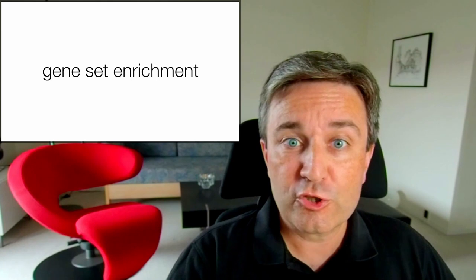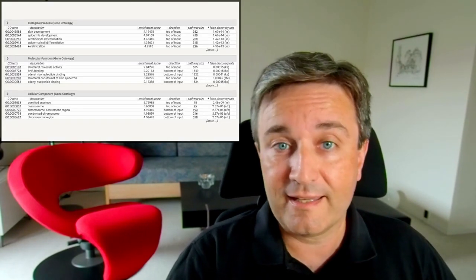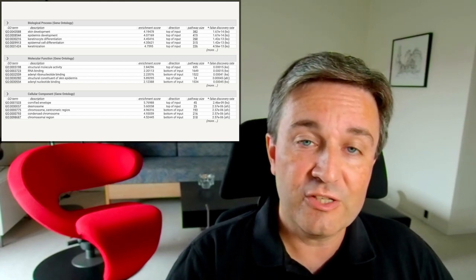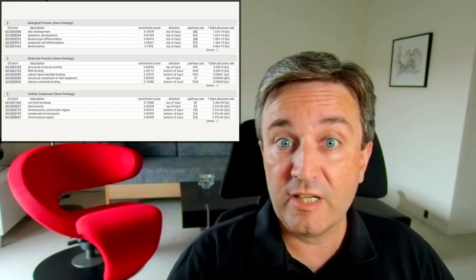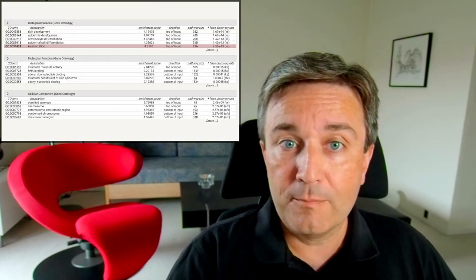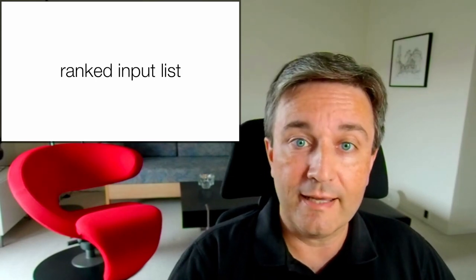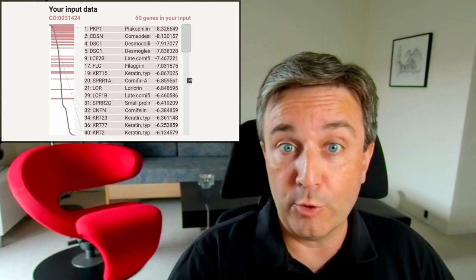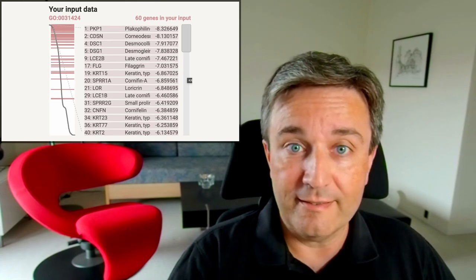Once you hit search, it will perform the geneset enrichment analysis and you will see the results presented again in tables. The columns are a bit different — for example, telling whether a certain geneset is enriched near the top of the list or the bottom of the list. You can inspect this further by selecting a term, and when you do that, it will be highlighted in the table and the corresponding proteins will be highlighted in the ranked input list, showing that the proteins corresponding to the selected term are preferentially near the top of the list.